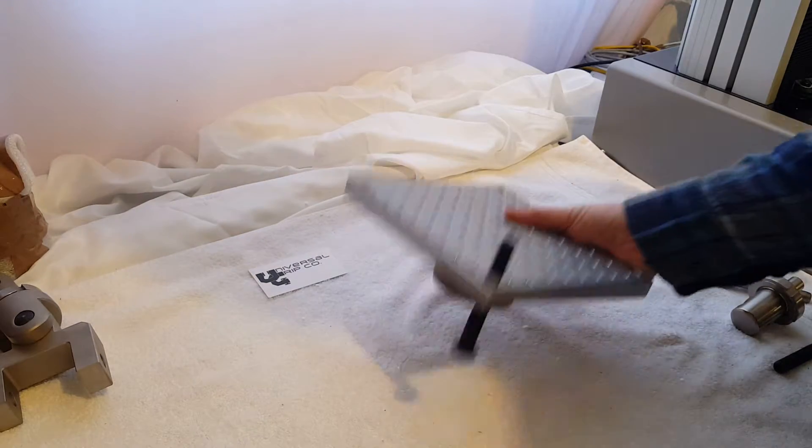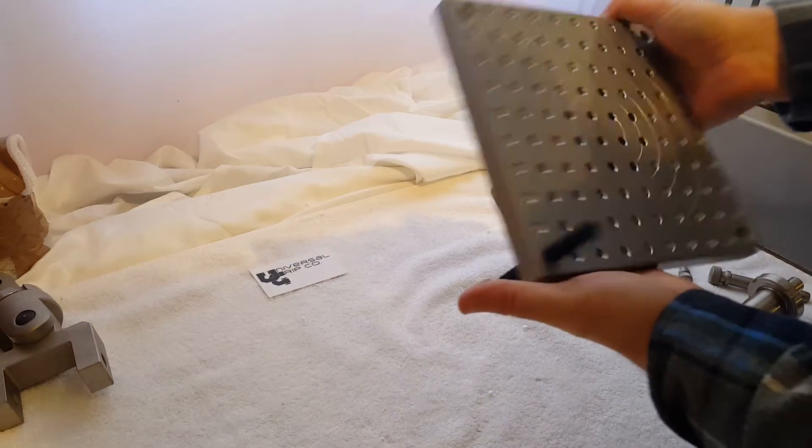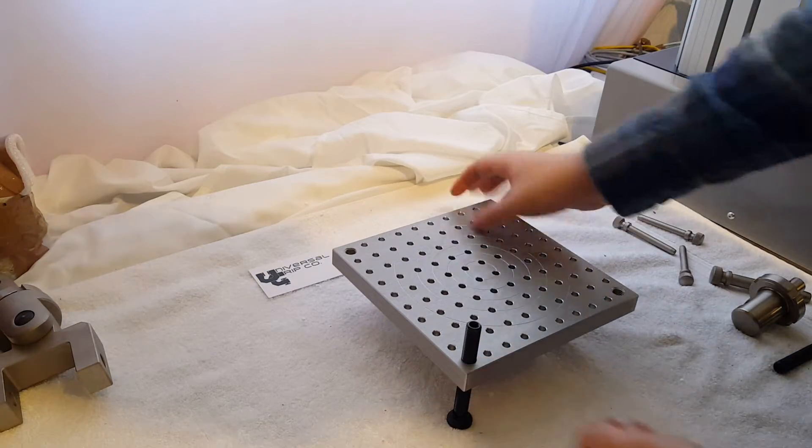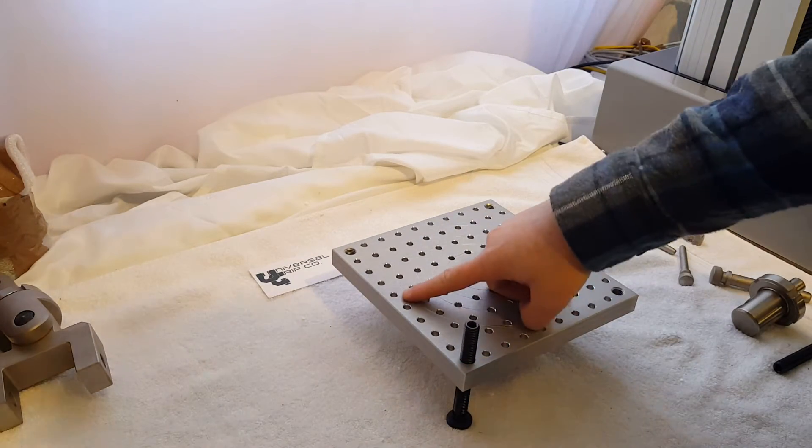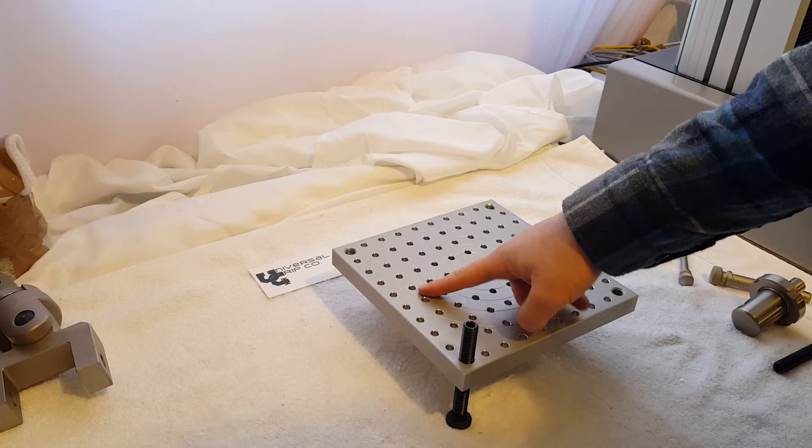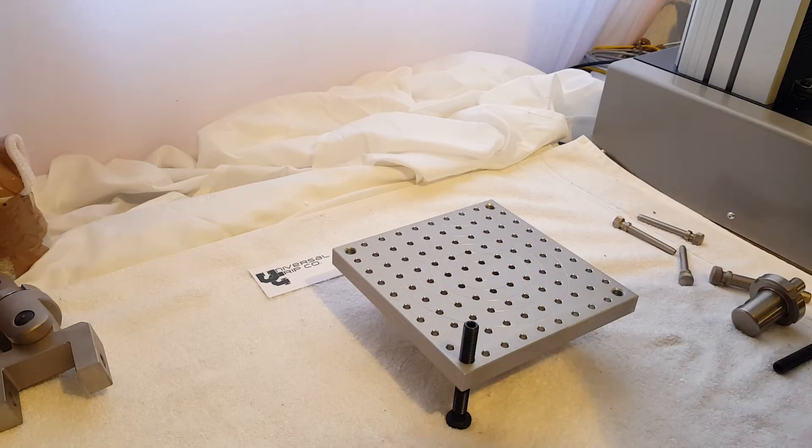So again, this is a compression table or compression platen for ASTM D3574. It has the holes drilled in it about 20 millimeters apart, 6 millimeters in diameter for the holes.